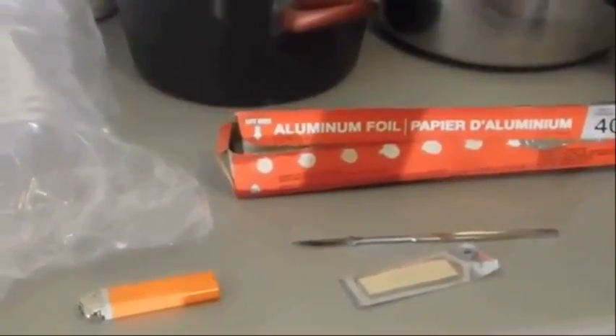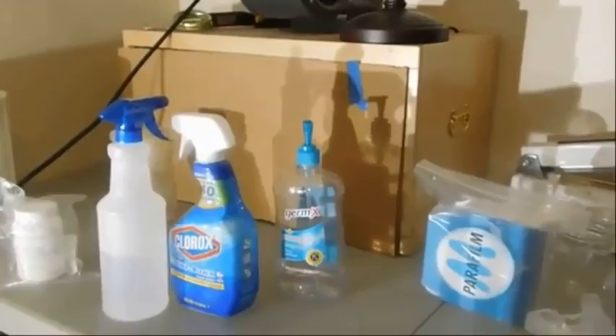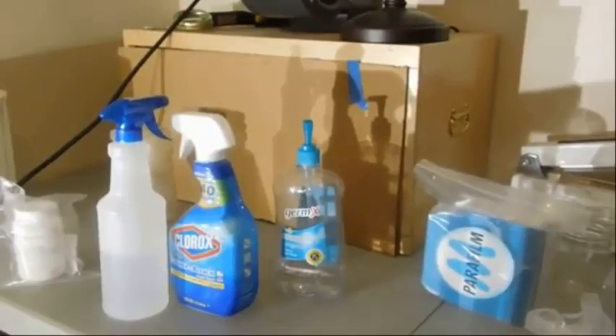You'll need a scalpel and scalpel blades. I'm going to be using a laminar flow hood. You can also use a glove box or a regular box fan with a HEPA filter, but of course you're more at risk for contamination with those options. Let's get everything started.